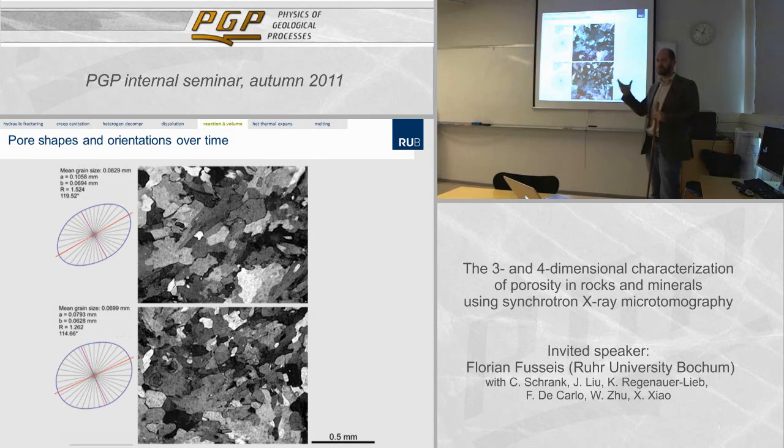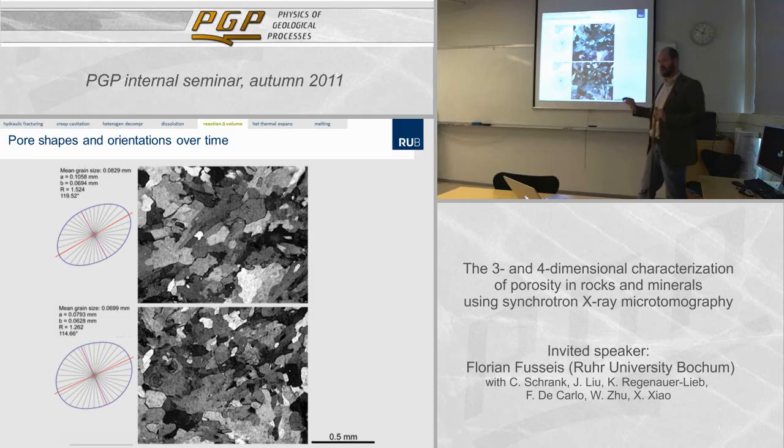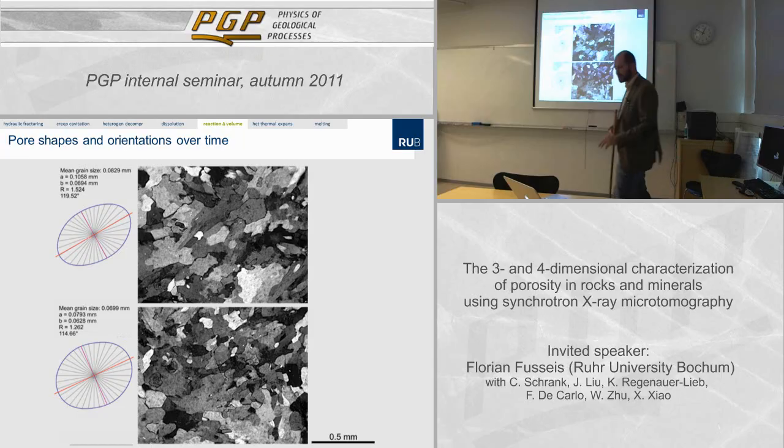And we did find that, of course, it's the gypsum crystallography that determines this. It's not just the crystallography, but the shapes. It's a combination of both, actually, because the shape is tied to the crystallography anyway. The water is leaving the gypsum crystal fastest in a particular direction, parallel to the basal planes, and that is where the advance of the reaction front is happening fastest. So if the front meets a bunch of crystals which are favorably oriented, it will be faster there than perpendicular to that.